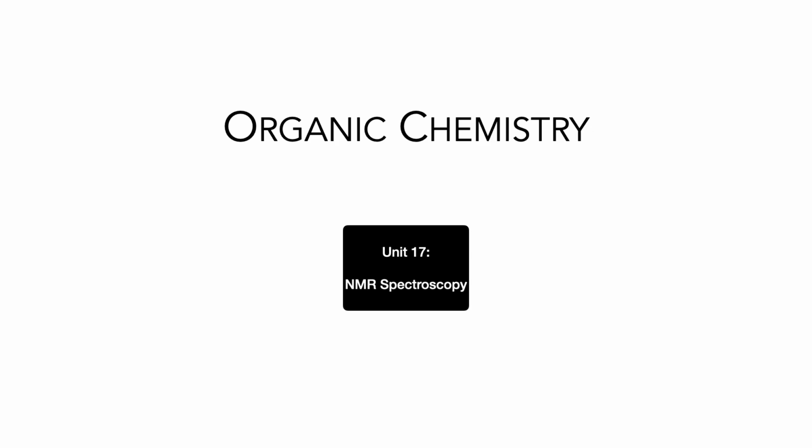Welcome to Organic Chemistry. Unlike IR spectroscopy, which has told us about bond vibrations and functional groups, NMR gives us direct insight into electronic environments surrounding nuclei within a given molecule. In many ways, NMR is less about identifying atoms themselves and more about understanding how molecular structure redistributes electron density throughout a system. Let's get started.